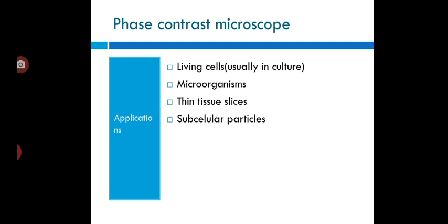So these are the various applications of the phase contrast microscope.